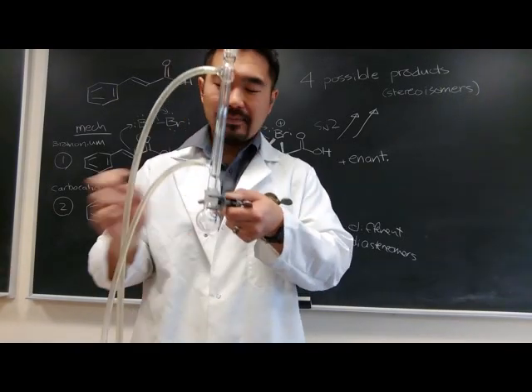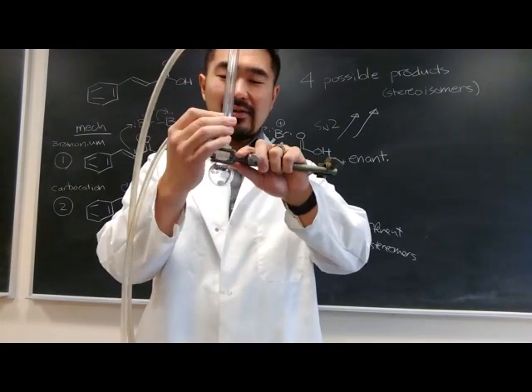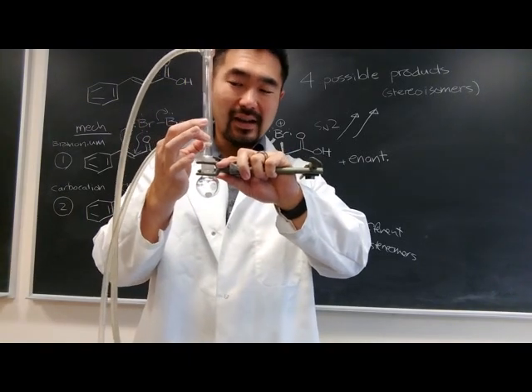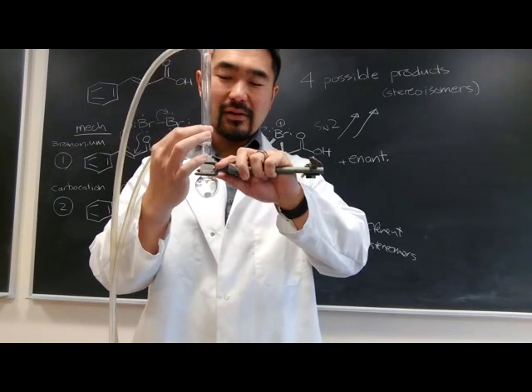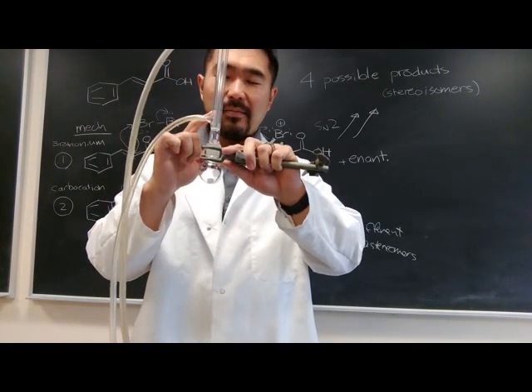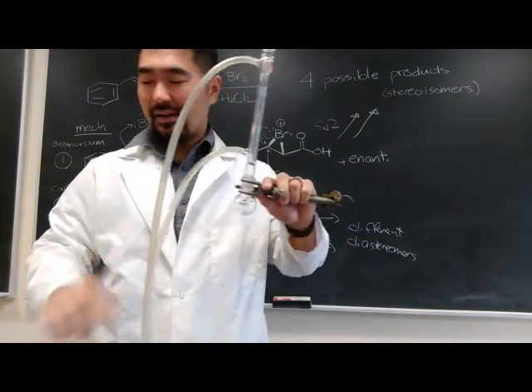Now, when the boiling point is reached for the solvent, of course it will evaporate, and what happens with this condenser that's water cooled is when the warm vapor hits the condenser right here, it condenses back to liquid. The gaseous solvent will condense back to liquid, and then it just drains back into the flask, and then it boils again. The warm vapor hits the condenser, condenses back down into the flask, and that back and forth action, that's called reflux in chemistry. Okay.